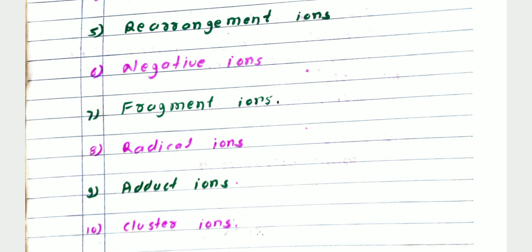But if heterolytic fission is carried out on the AB molecule, and B is more electronegative, then it abstracts the electron pair completely towards itself. Therefore A acquires a positive charge and B acquires a negative charge, forming one cation and one anion. So homolytic fission forms radicals, and heterolytic fission forms cations and anions. After homolytic and heterolytic fission, a radical ion is formed.